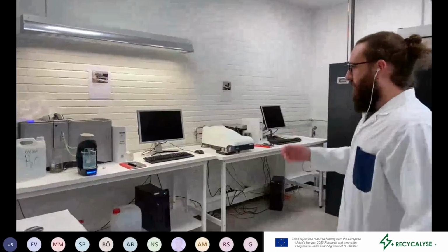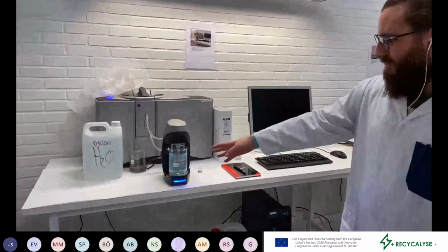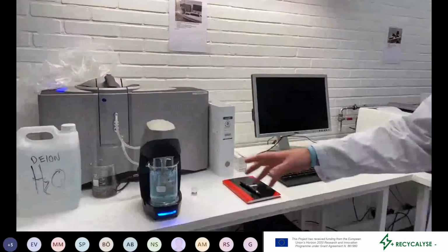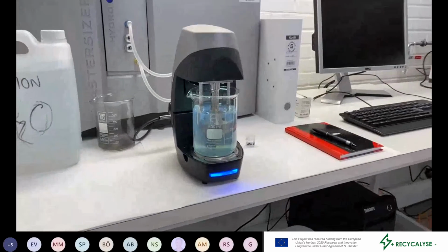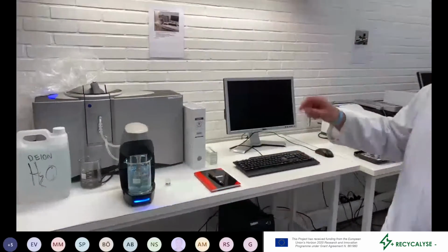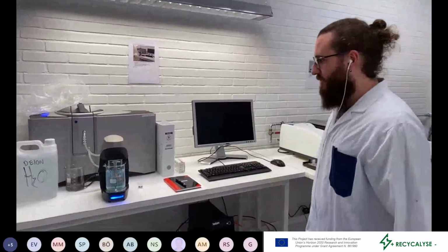here is where particle size determination happens. The first instrument here, where you can see this beautiful blue solution, we have ATO inside right now, is our laser diffraction instrument, where we can measure both powders or suspensions or any combination of the two.